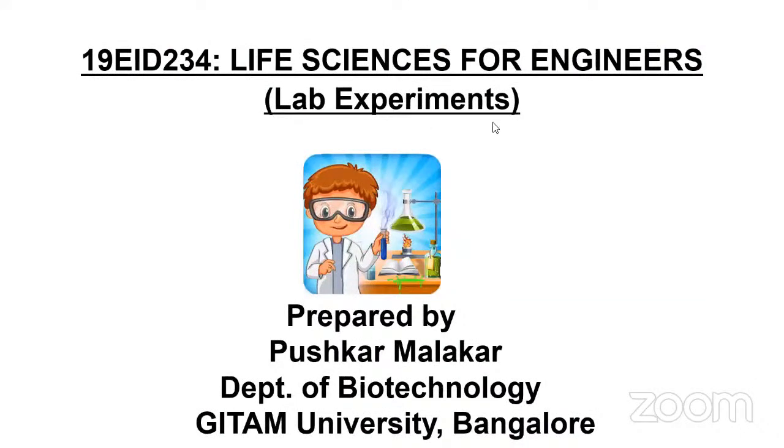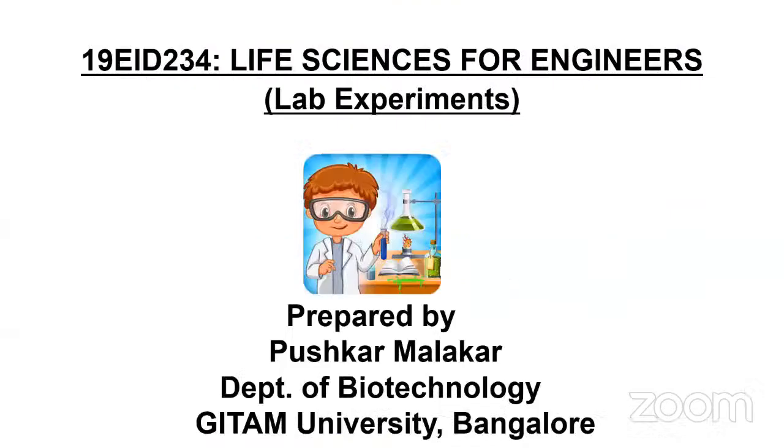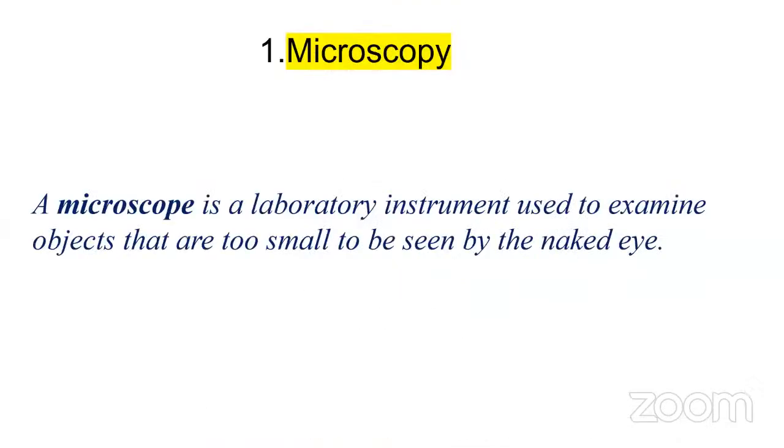Okay, good morning, everyone. Once again, today we are going to start the lab course for life science for engineers, which we were supposed to do. So the first practical in this regard is the use of microscope, that is microscopy.